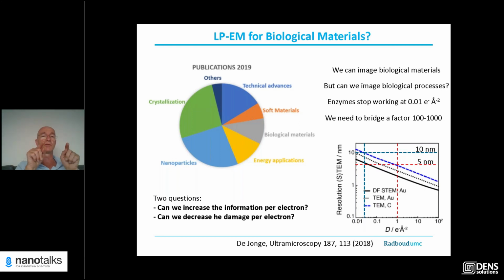So when the water enters, it will then diffuse into the acetone layer between the layers from all sides. So in fact, you could combine any solution in principle that you want in this way. Yes, yes, but we have to take into account the following. We did it with more different systems.